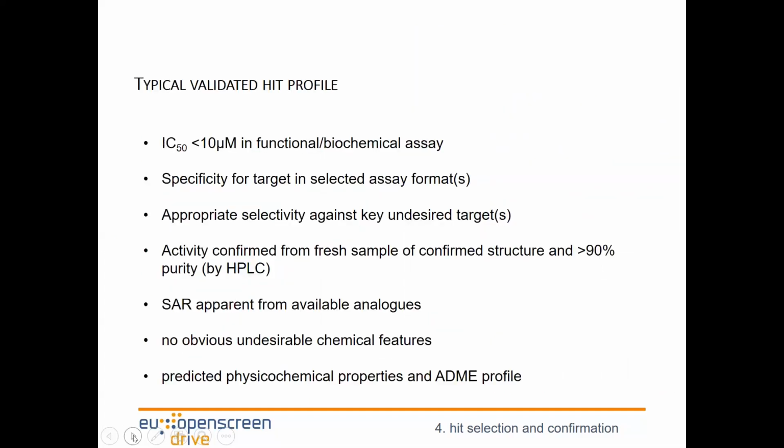So our final validated hit list will contain compounds where we typically have IC50s of less than 10 micromolar against our target of interest. As we can relatively easily get some selectivity profiling done, profiling a small number of compounds, maybe exemplars from each scaffold, in a panel of selectivity assays should be done to get an idea of selectivity.